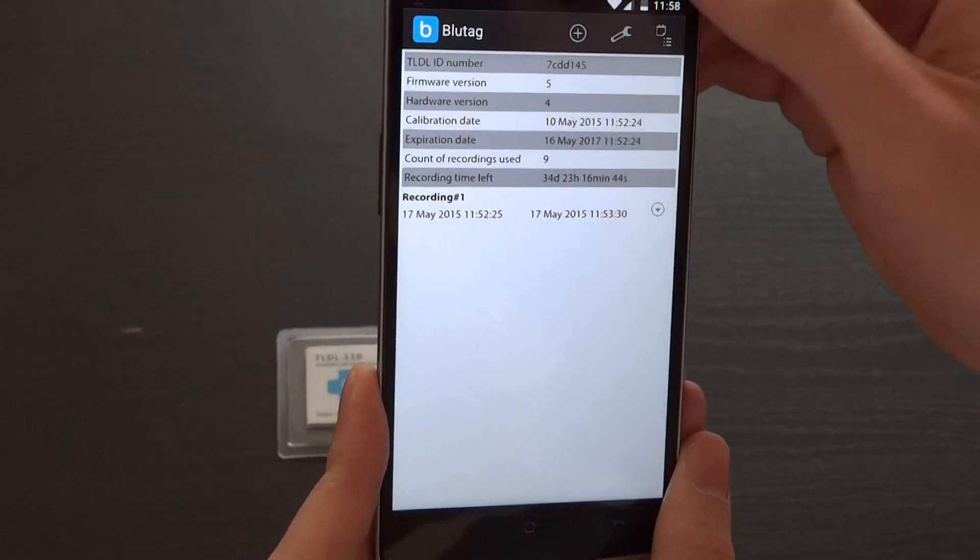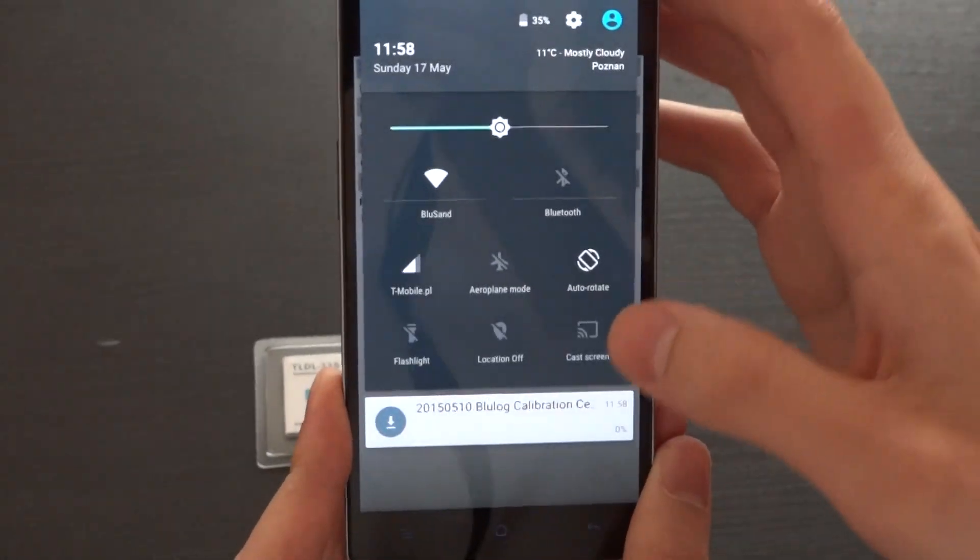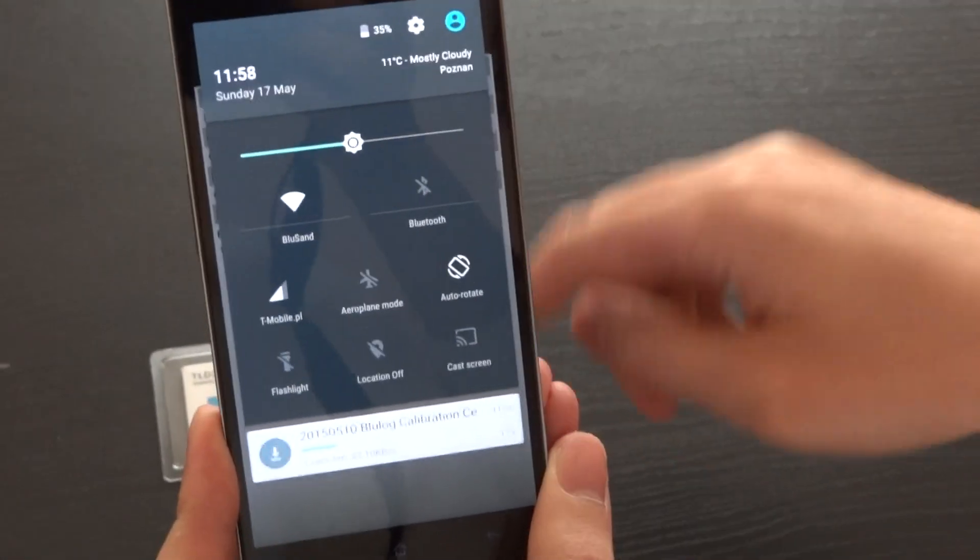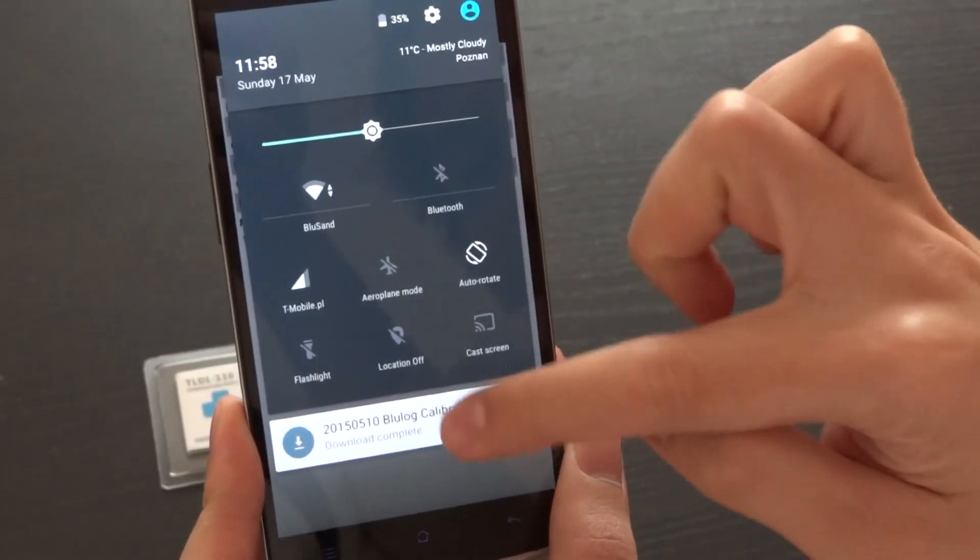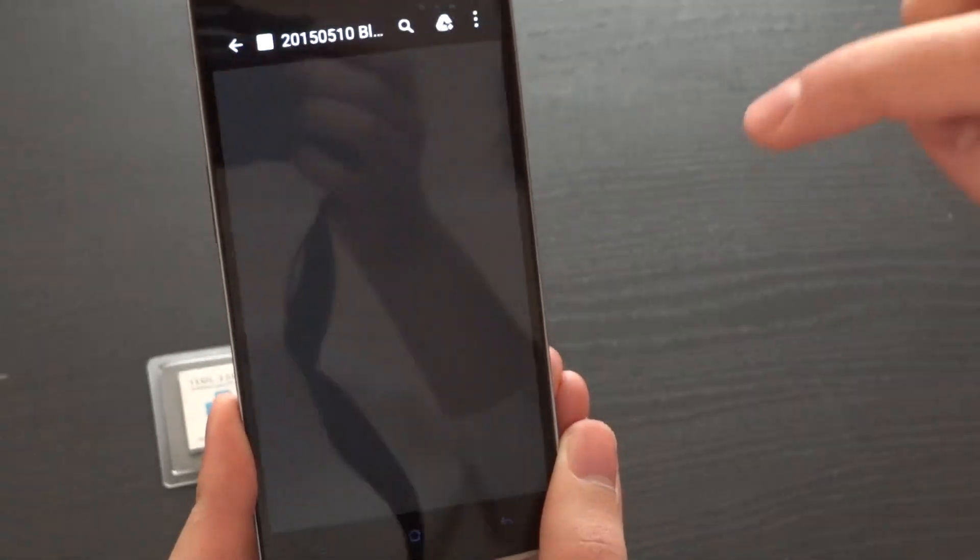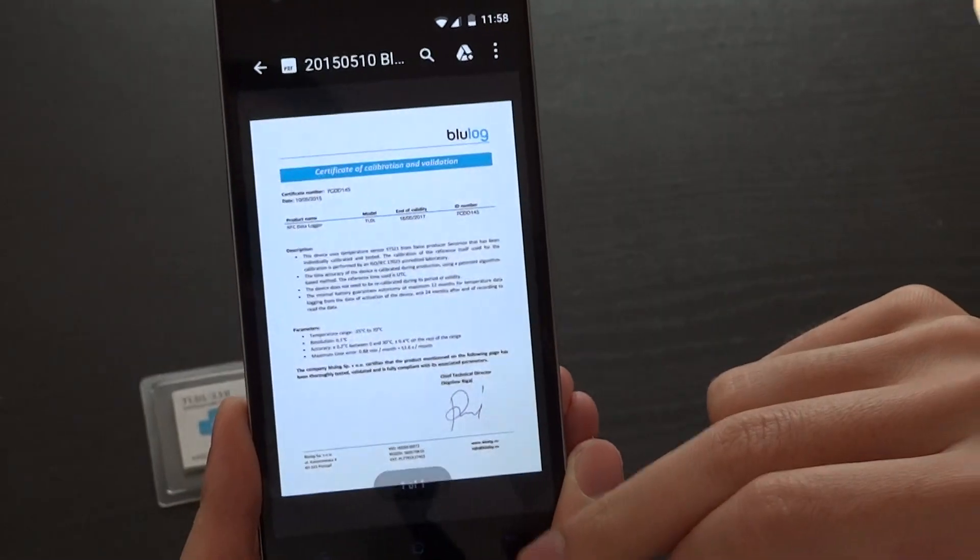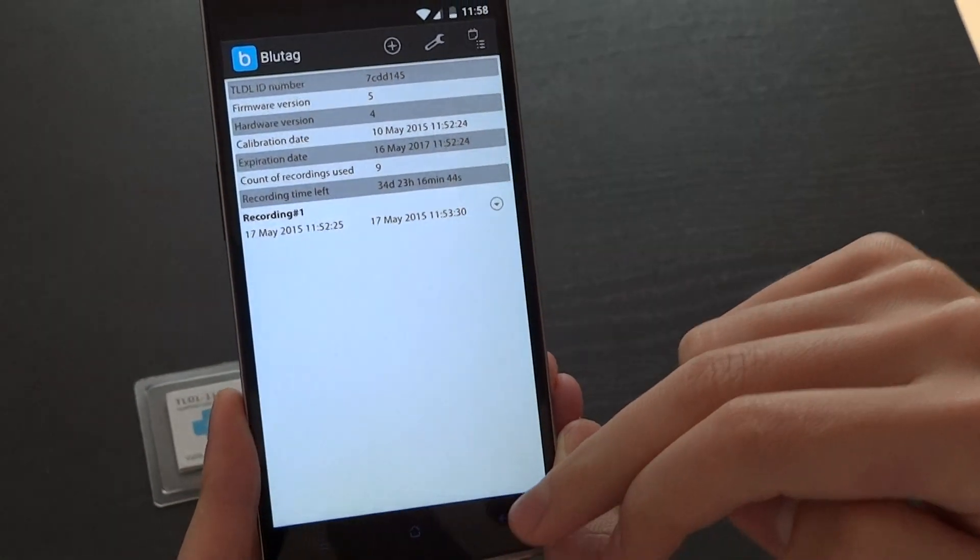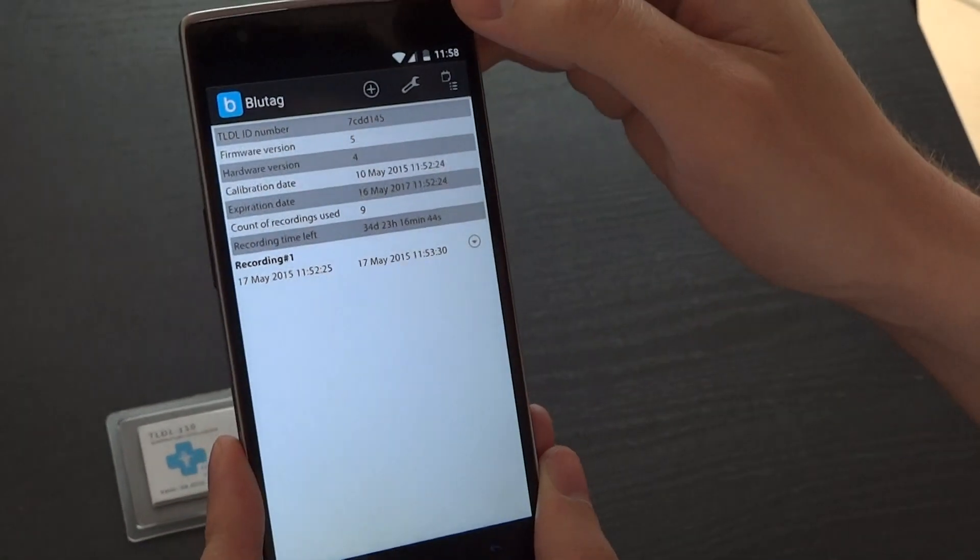From this page, you can download the calibration certificate which is provided for each device, and you can start a new recording.